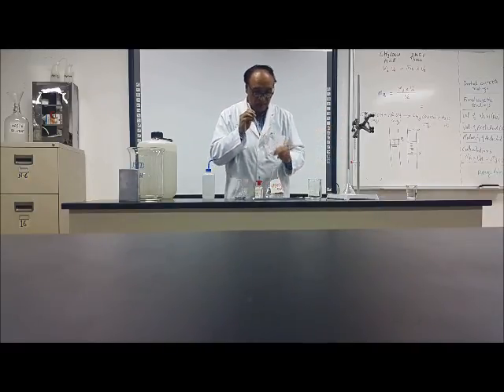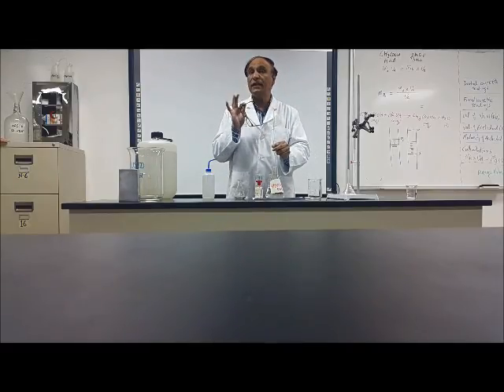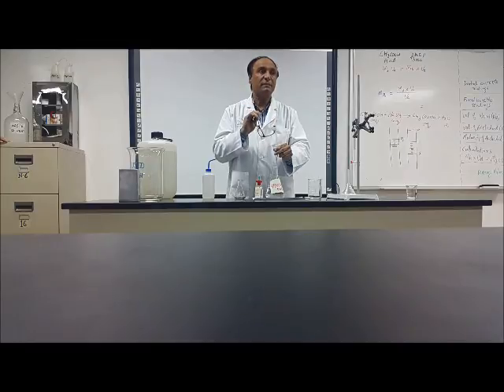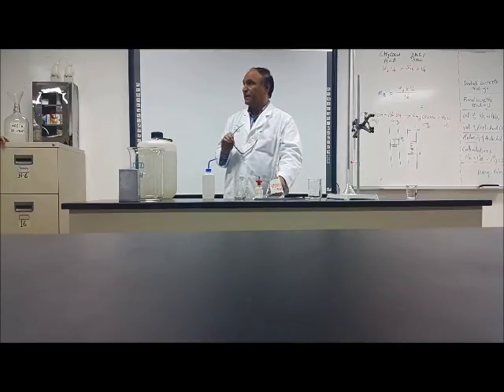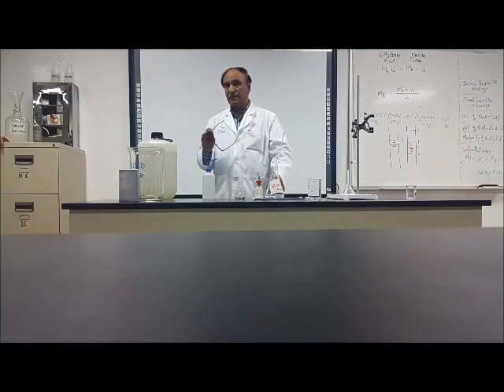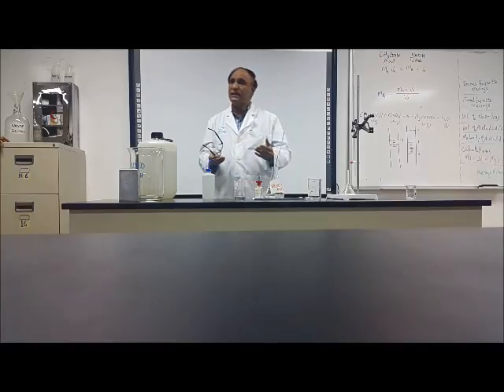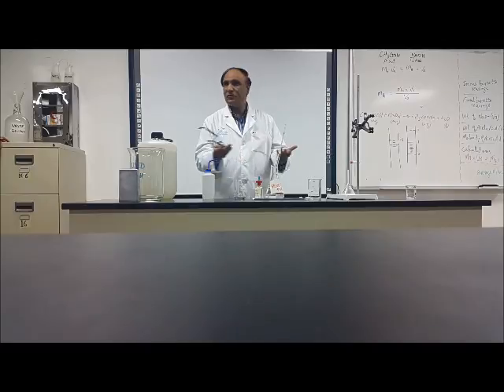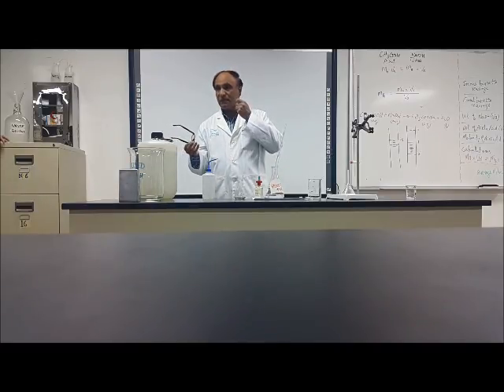Now I will take this one up to the mark. It is not easy. It will take maybe 5 times, 6 times, many times. It needs some experience. This is acetic acid. This is not dangerous. This is khal. You take it in the food. So if there is water, it is not dangerous. If there is glucose solution, not dangerous. If there is a Pepsi, not dangerous. You drink the Pepsi.